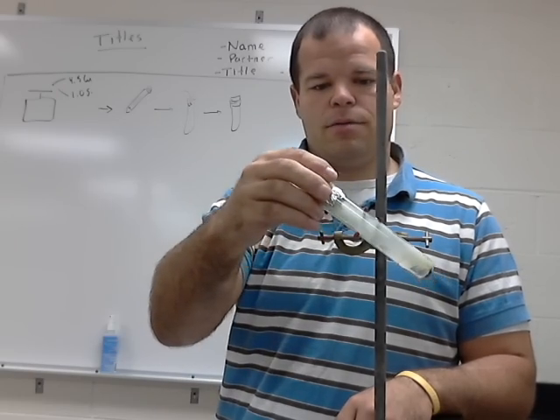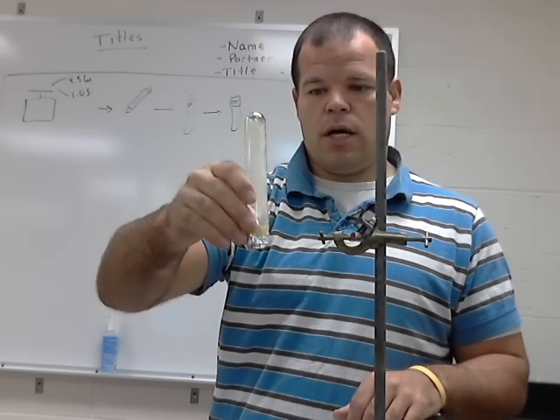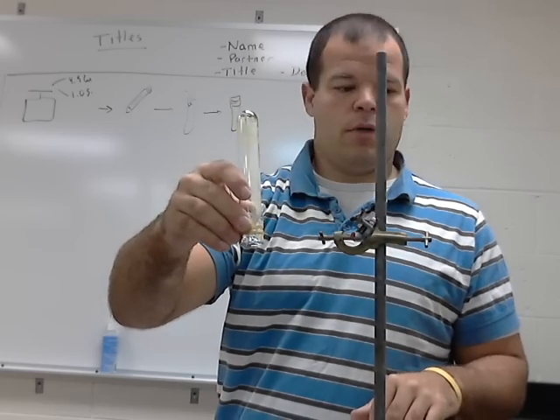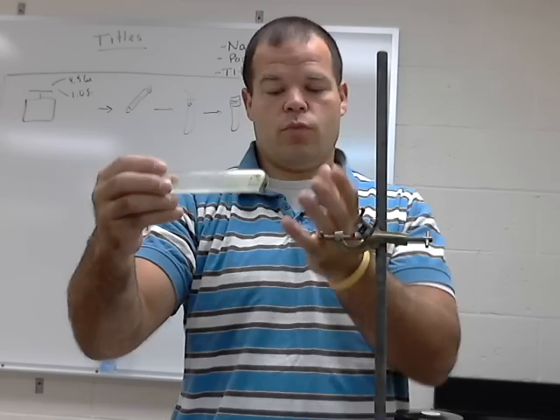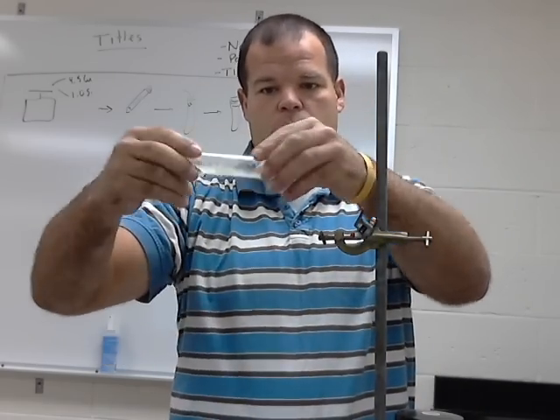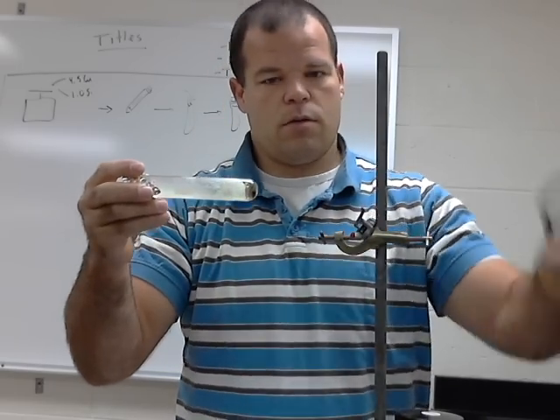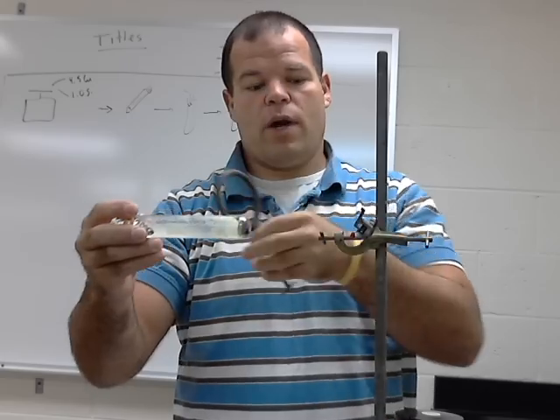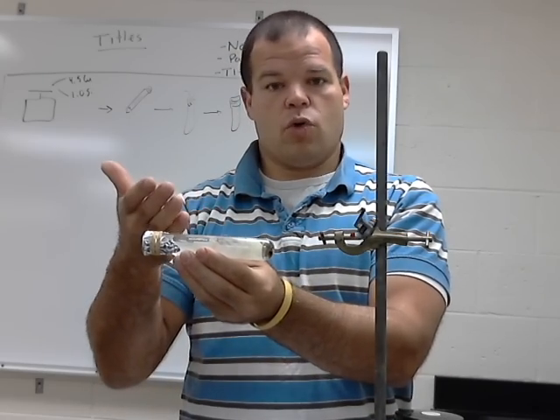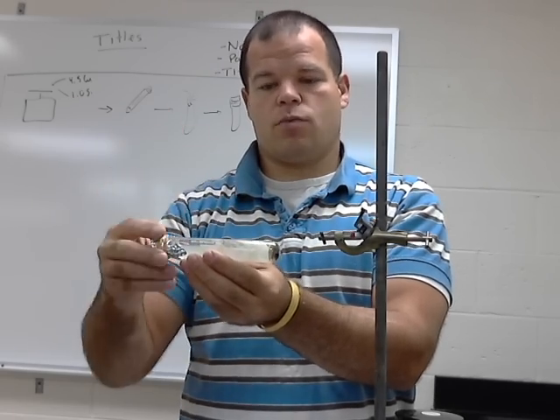When this gets hot, after a reaction takes place, we want to try to get the material out of here. You can tap this down onto your lab bench to try and dislodge the new material. If it doesn't come out, then we're going to break the test tube to get it open. We reuse these test tubes every year and add a few more. What you want to do is wrap this in paper toweling so the ends are somewhat secured, and hit it with the ring of a ring stand, break it, unravel it, remove your new material, inspect it as the instructions provide, record your data, and then roll the paper towel and put it in the glass waste container.